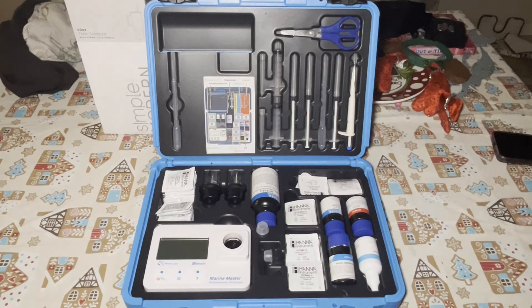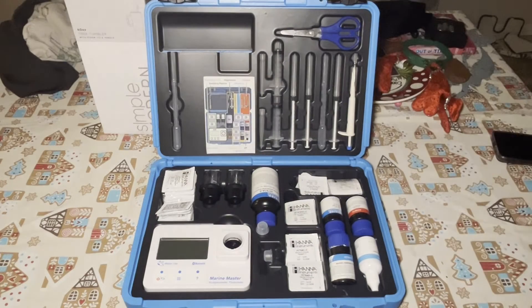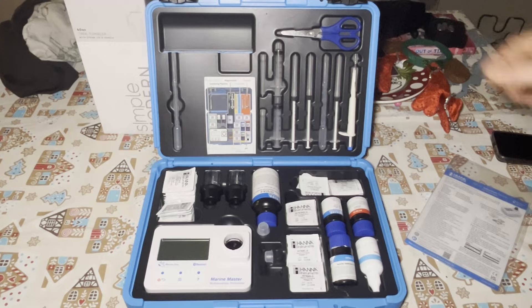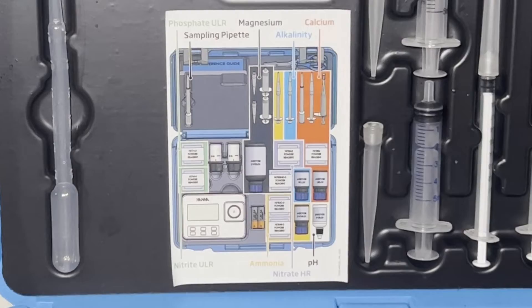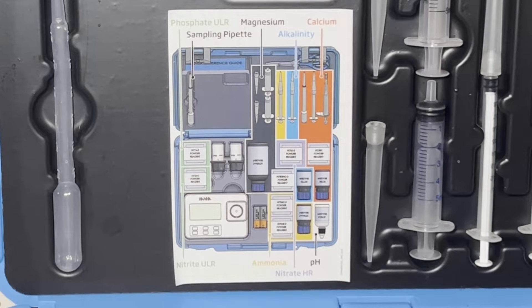Inside we get a quick reference guide, and here we get the actual tester itself. Hanna has even included a pair of scissors with the kit. My thought on the scissors — I don't think they're personally the best, but they get the job done. There's actually a little label showing everything you get inside the kit, and literally as soon as you get it, it is ready to start testing.